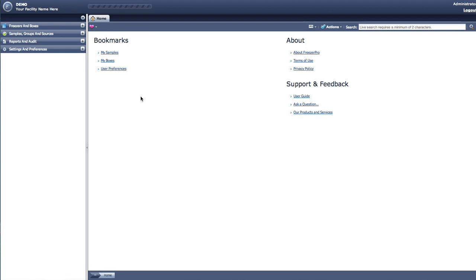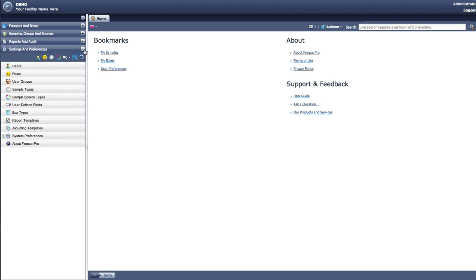In this video, we will be covering the basic configuration steps for managing user-defined fields in FreezerPro. This will largely take place in the Settings and Preferences section and will require administrative privileges and access rights. For configuration tools, expand the Settings and Preferences section.